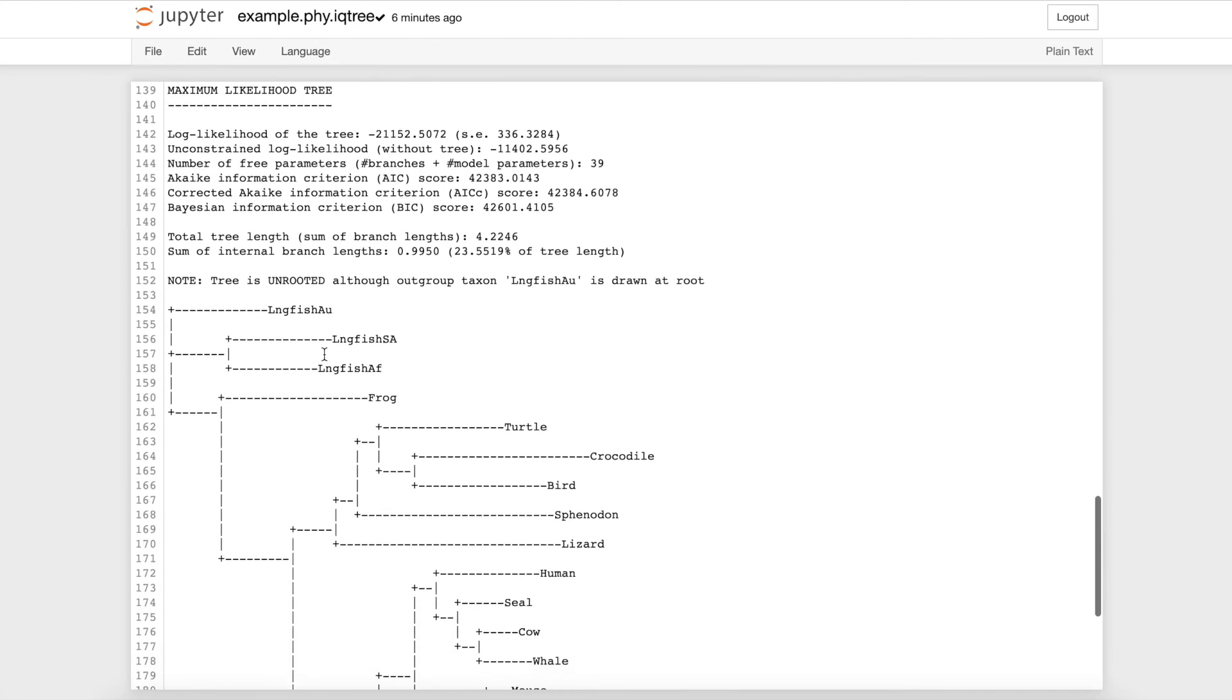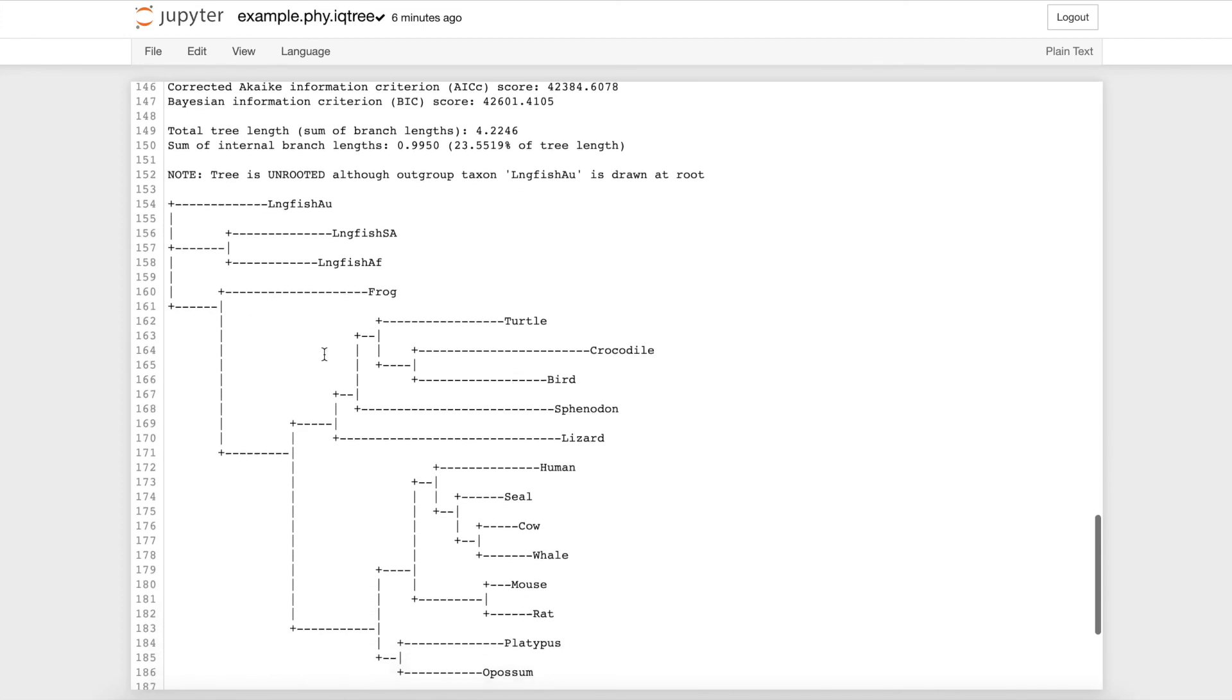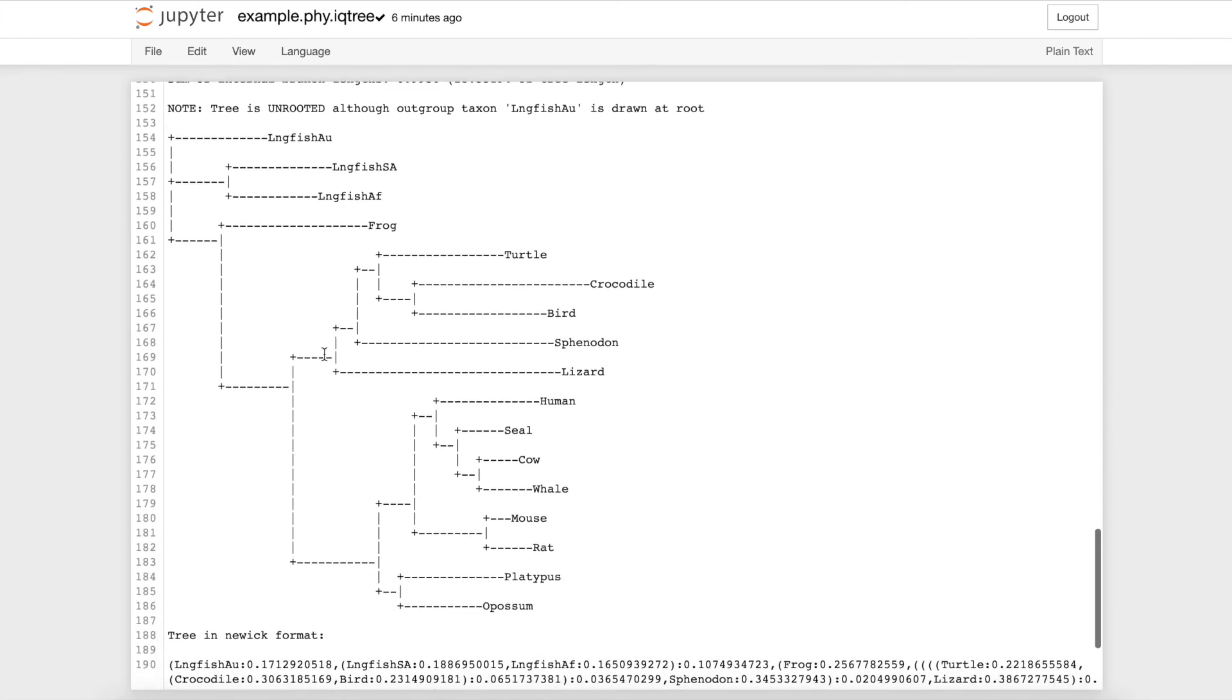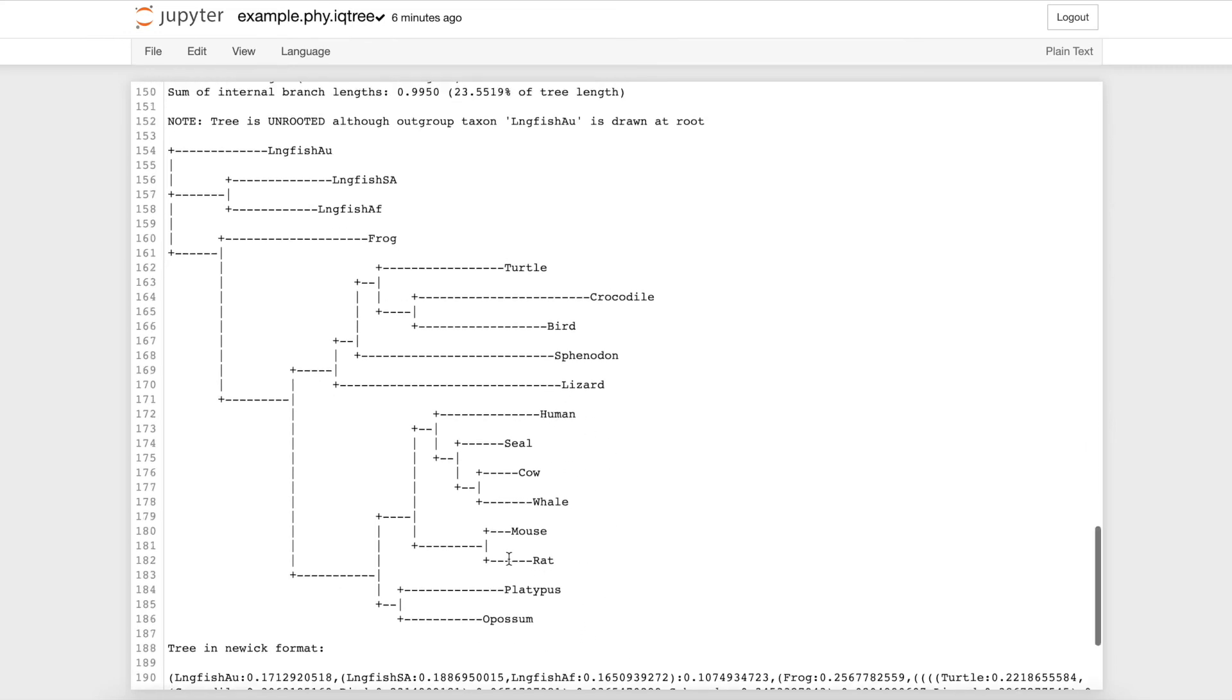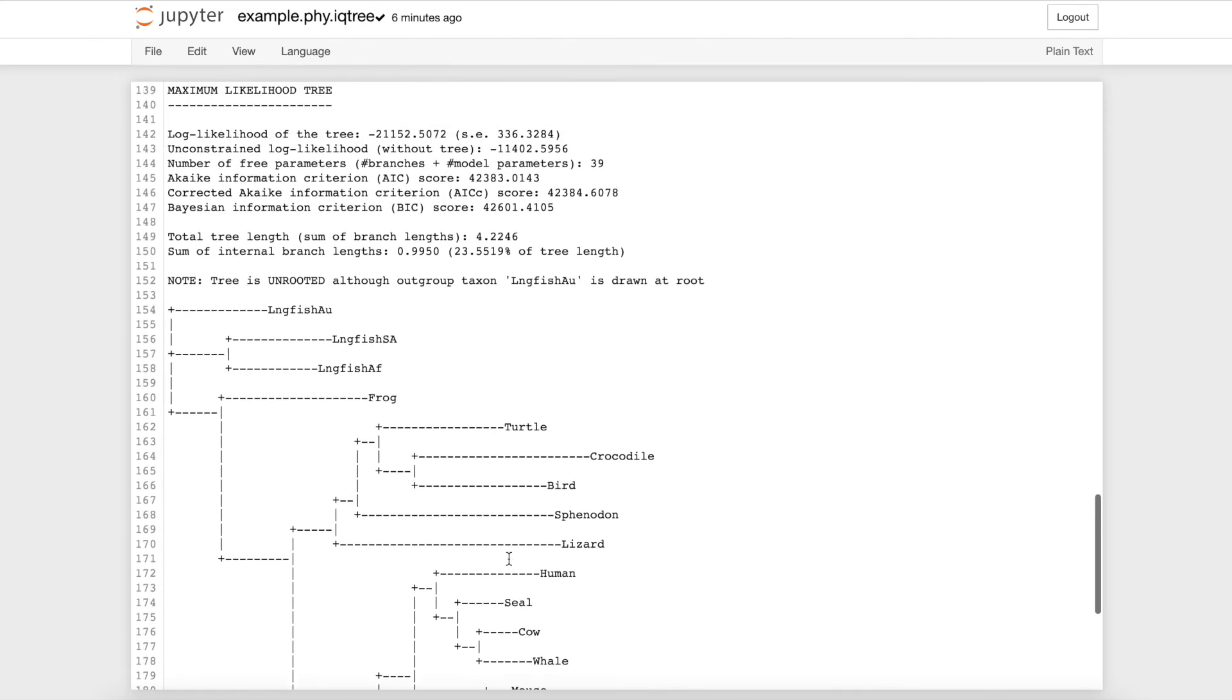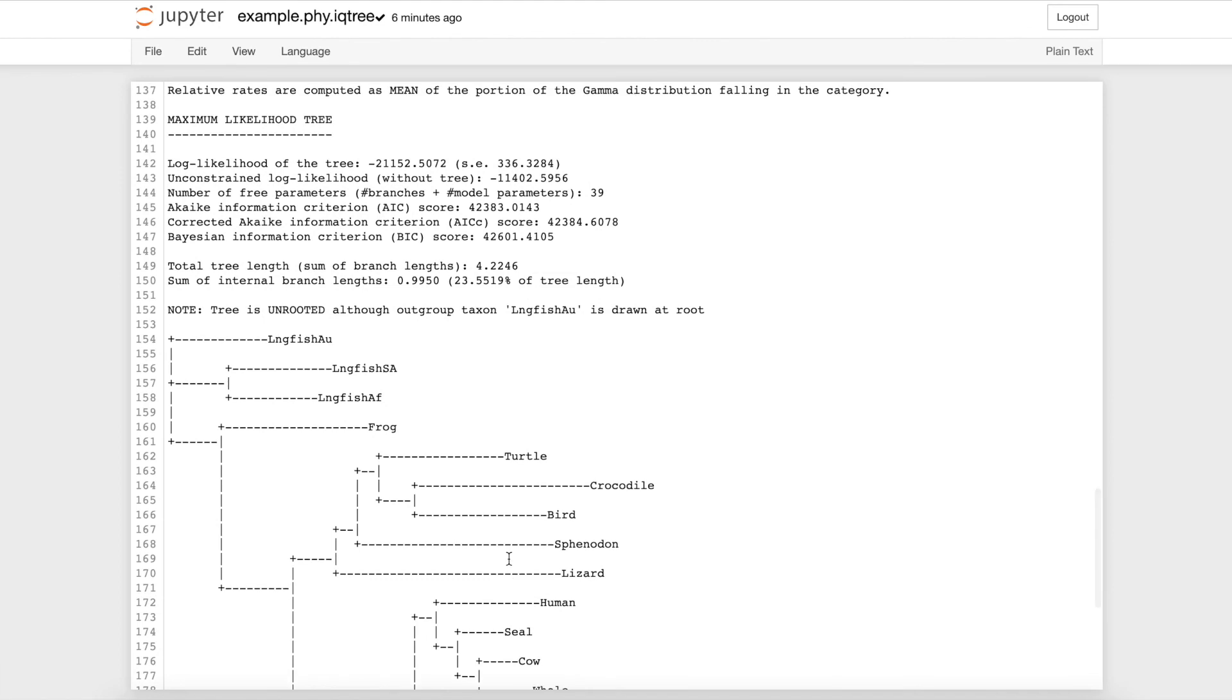If you have studied phylogenetics in any way, this tree seems to align with common principles of evolution. Lungfish belong to a clade, reptiles and birds are in a clade, and mammals are also grouped together in a sister clade to the reptiles and birds. This makes sense because lungfish are the most ancient species of the organisms within our example file.